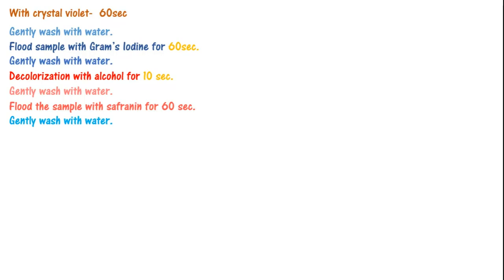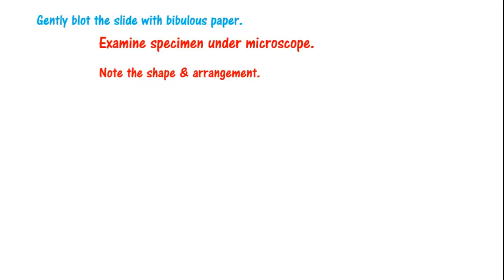Now you have applied the reagents. Take the slide and under it use a bibulous paper — slowly tap it and dry the wet slide. Then observe it under the microscope. You will see the shape and determine: is it positive or negative? Gram-positive will be purplish, gram-negative will be red or dark pink. You decide this.